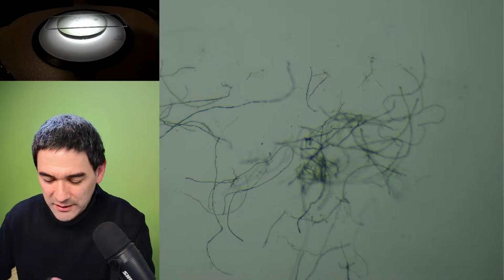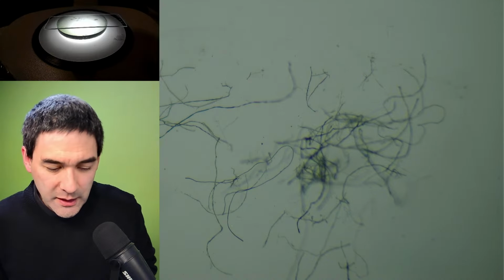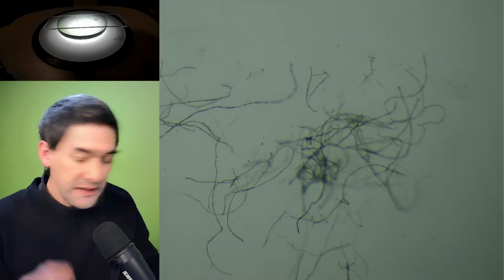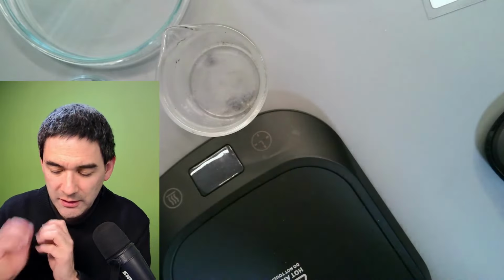I just check the time a little bit. I do have over here this, I showed you this, and I do have just a second over here. Paracord cotton dust. Yes, another thing that I want to show you. A couple of years ago, maybe 3-4 years ago, I got an email and I said, oh my gosh, people are worried about really certain things.